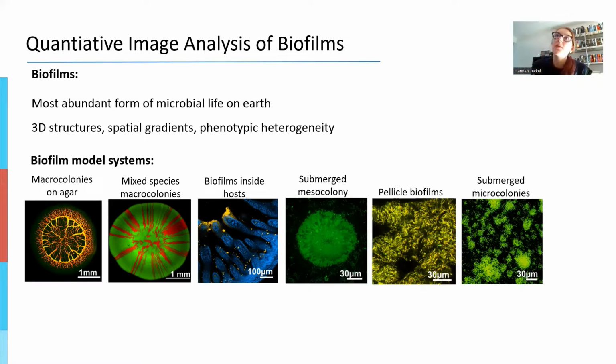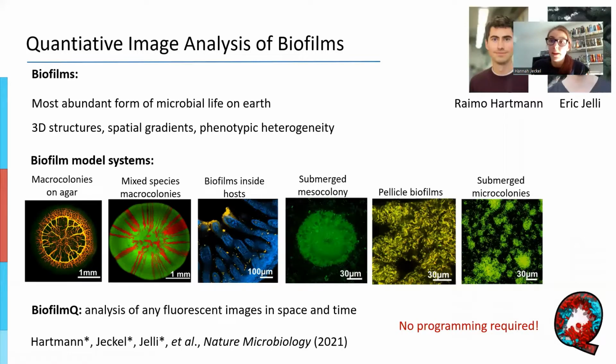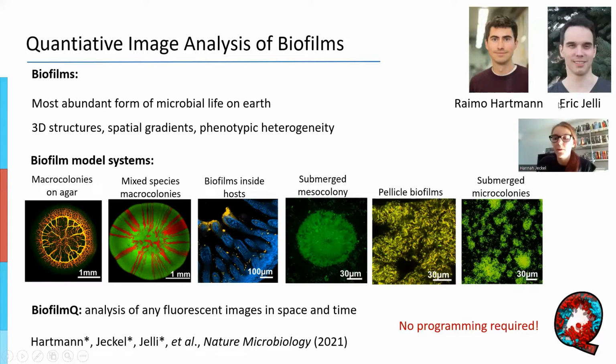And we were wondering if there was a universal way to analyze these communities, and not only make it accessible to us, but actually also to our collaborators who asked us to do the analysis in the first place. Was there anything we could do to bring the analysis to the biologists who know the questions better than us, who know the systems better than us? And the answer was BiofilmQ, which I developed together with two of my colleagues, Raimo and Eric, that you can see up here. So we eventually published this paper in 2021.